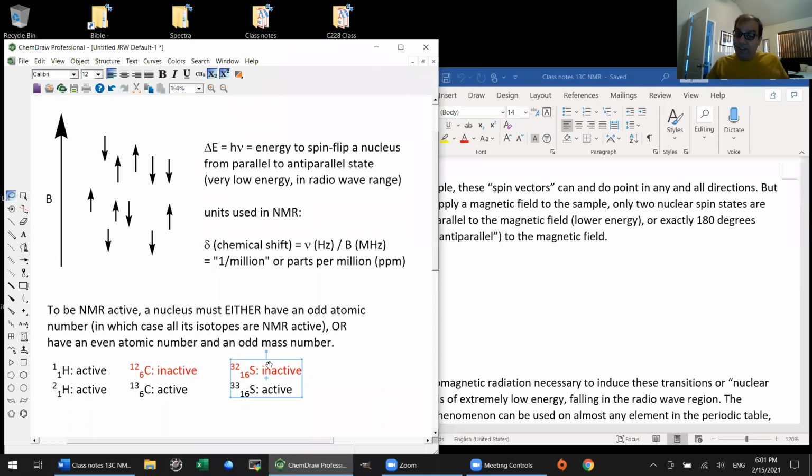To give another example, fluorine NMR is used quite a bit. Fluorine, I believe, is element number 9, and so it's going to be NMR active. The major isotope of fluorine is NMR active, and fluorine NMR works quite well. I've heard of nitrogen-15 NMR being done. That works pretty well. Phosphorus-31 NMR works quite well if you have a compound with phosphorus in it.